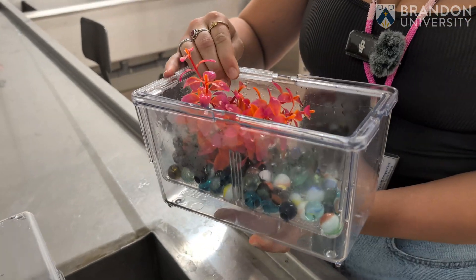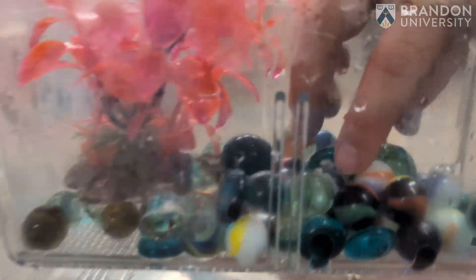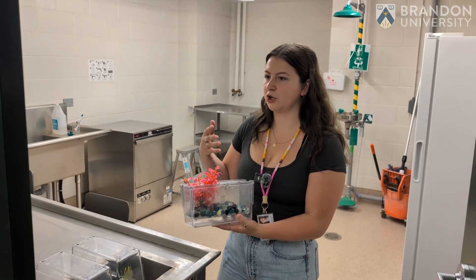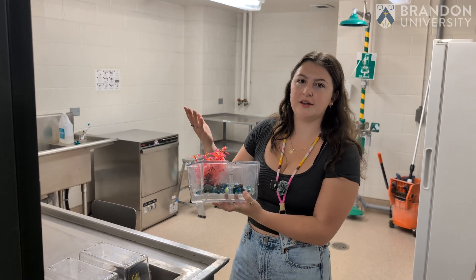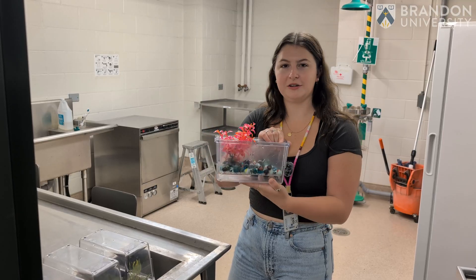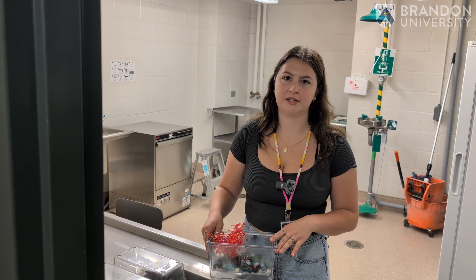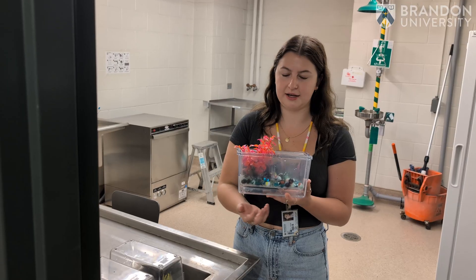These are our breeding traps, and this is how we collect the embryos from the fish. You can see that there are marbles put in here as well as a colorful plant. When we put these in the tank and decrease the water flow, it mimics a more shallow water environment like where zebrafish are found naturally in Asia. Once the lights are turned on in the morning, that triggers their breeding — they go into this little trap, mate, and breed. We're able to collect the embryos from the space at the bottom. It's similar to salmon in that it's external fertilization: females expel their embryos and males produce sperm to fertilize them as they're laid.